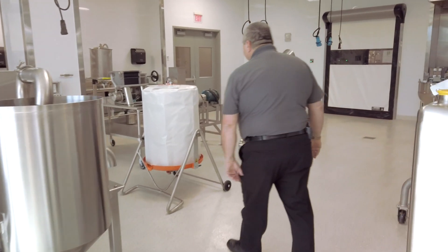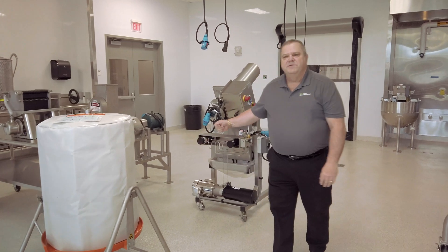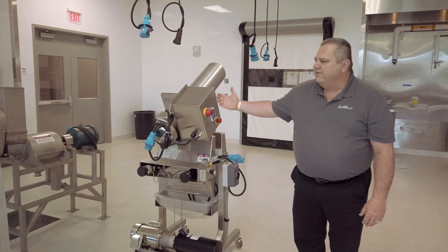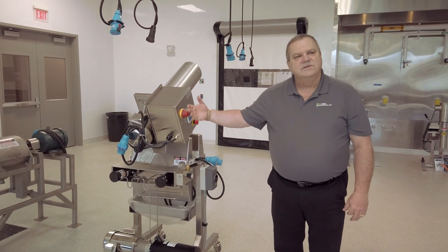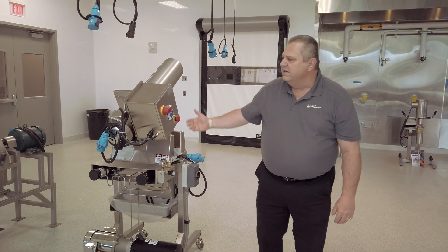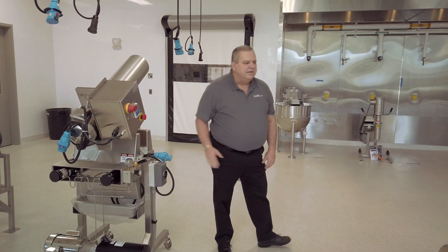Other things we can do are press out juices. A number of fruits and vegetables are being used today for juice beverages, so we have to have a number of different configurations to extract juice. With bladder presses, we have an extractor finisher, and we have a traditional juicing machine.